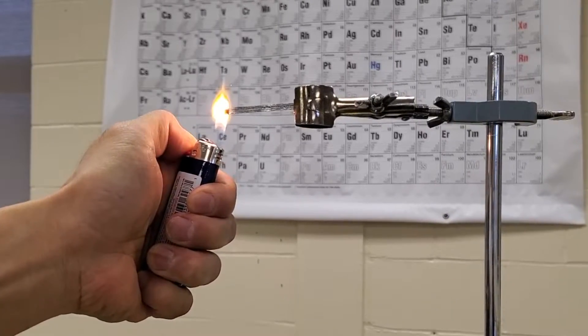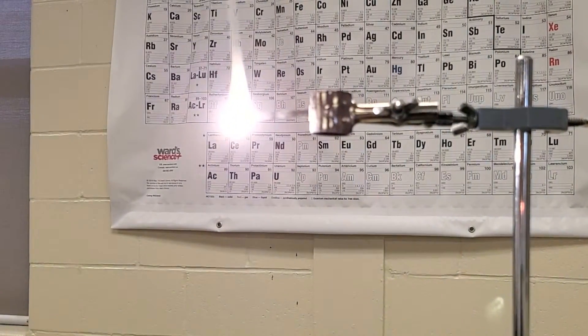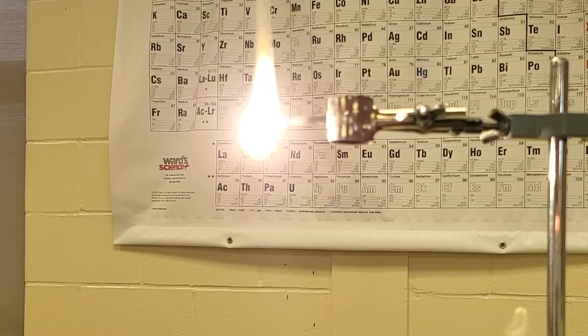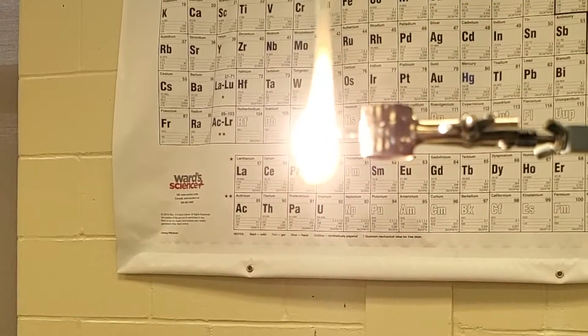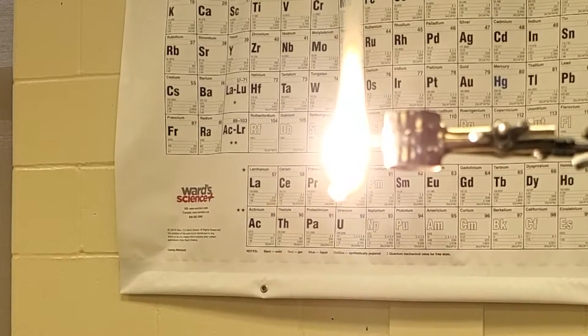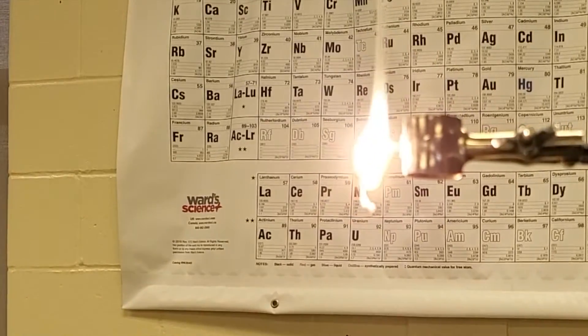I describe the reaction as burning with a bright white light. And after the reaction, you see what's left is this dull white brittle product called magnesium oxide.